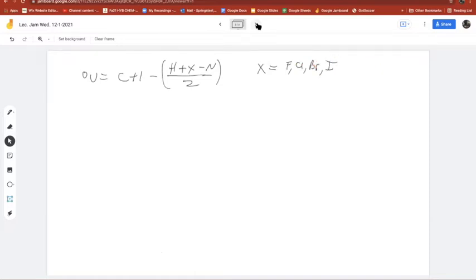Okay, so if I look at a molecule and compare it to the bromide, you see how the bromines and the hydrogens are pretty much the same. You're just replacing a hydrogen with a bromine. And that's why they both get treated the same in the formula.